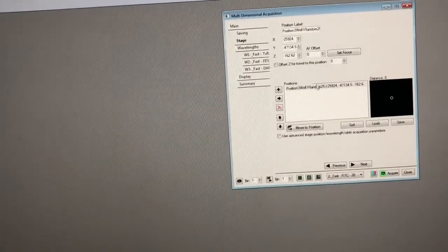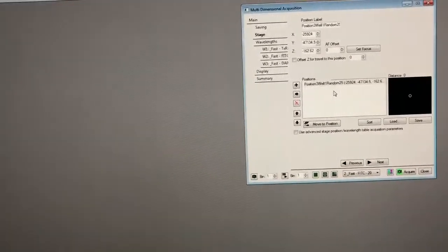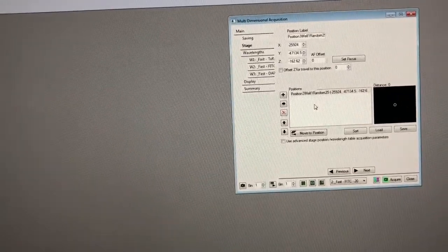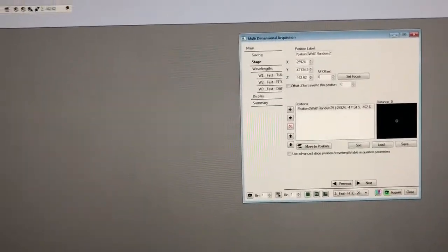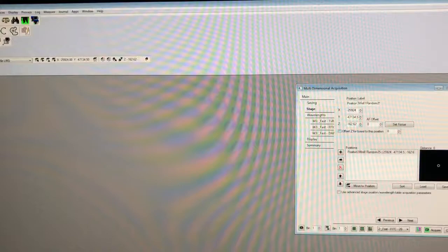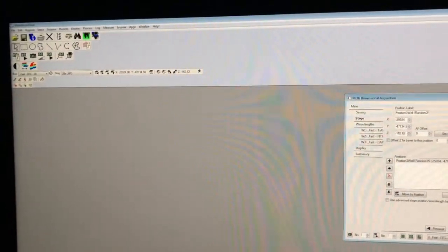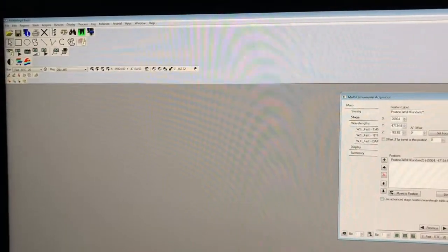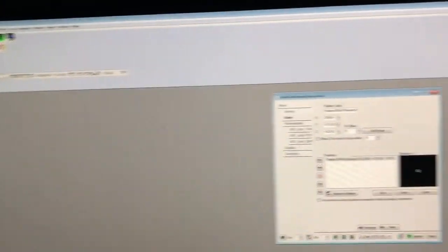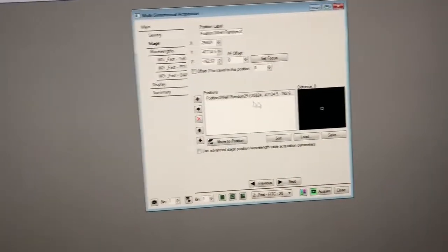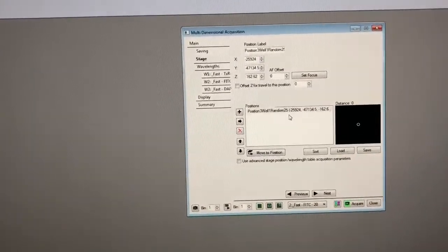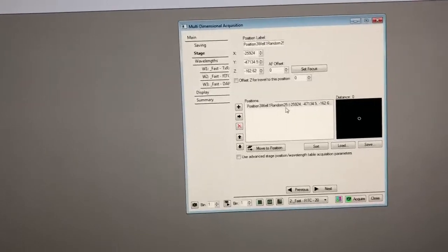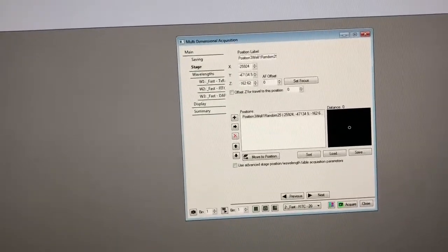All right. So now to make a list of random positions based on this one, we need to leave metamorph. So this is based on a macro I wrote outside of metamorph. And so we're going to run that little macro and that macro is going to generate another file that's a list of random positions based on some parameters we're going to give it and based on this center point. So let me show you how this works. So I'm going to minimize metamorph.